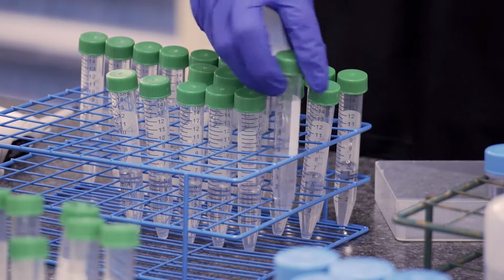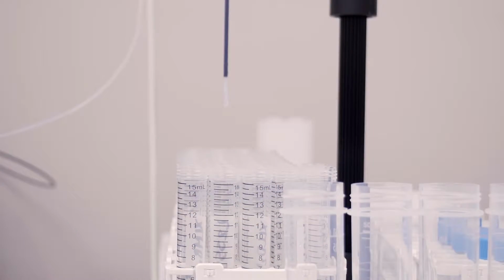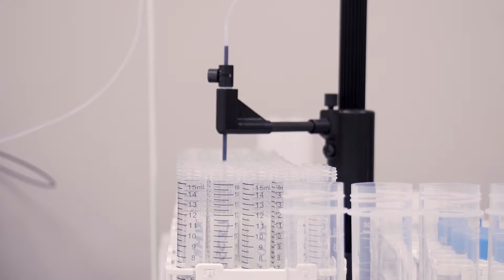So the idea of extractables and leachables is pretty simple on the surface. You take a fluid, an extraction fluid of some kind, and you subject your container, your closure, or your materials to that particular fluid. And that can be simply water or ethanol or an acid or a caustic type material. So very simply, you expose your material or your containers, closures to that particular fluid, and then you test that for elemental impurities. While it's simple on the surface, it becomes complicated because each one of those extraction fluids presents a unique challenge in terms of elemental impurities.